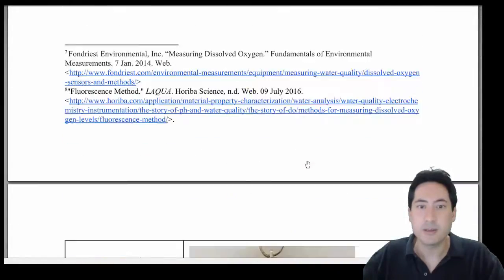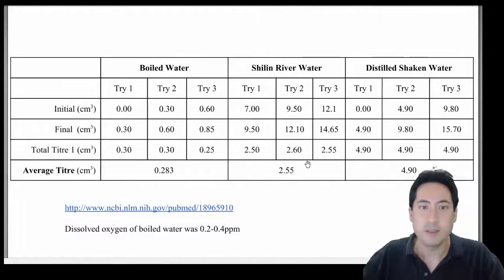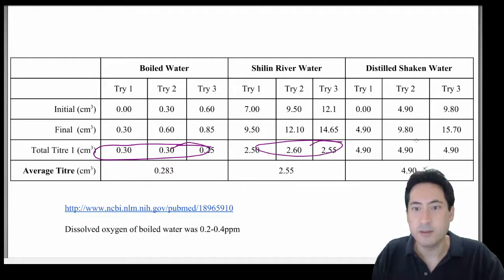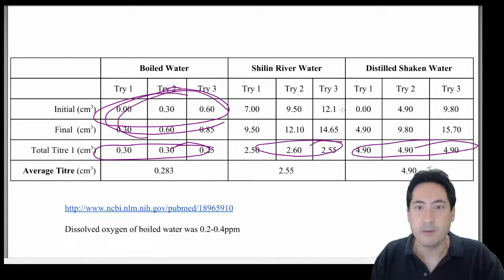So put that in there. Now this is a data check. So let me just go to the data first. Where's the data? Alright, range of 5. Okay, good. For titrations you've got your raw data, so don't just give me these values like people often do. Alright, not too bad. You're doing your titrations quite well, getting spot on, and this is the raw values. I've got to see these things. Okay, I would like to see the rough titration as well. Throw that in there.